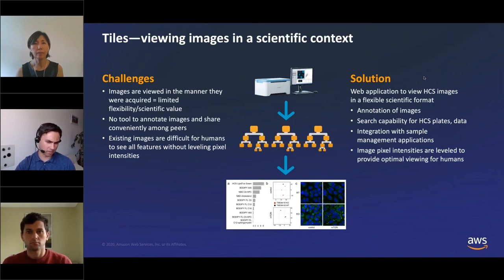So along with our scientific collaborators, we developed an algorithm to basically level the pixel intensities for optimal viewing. Of course, that's subjective, but it turned out to be, and Yangsha will talk about this a little bit, complementary to having the image analysis quantification, is making something that humans could really see and say, that's my answer. So we'll talk about that more.